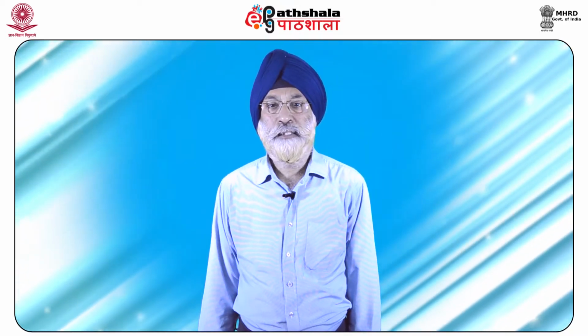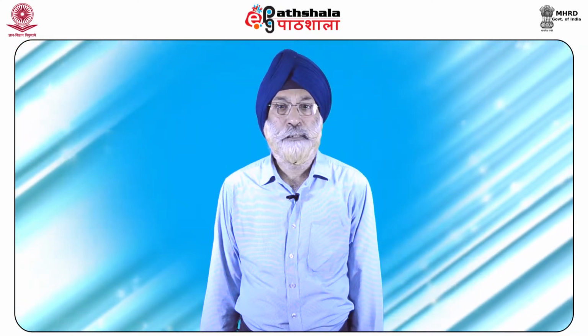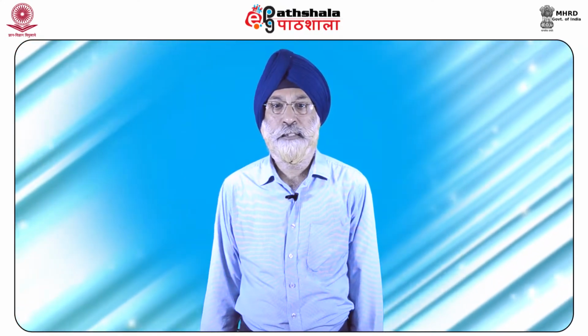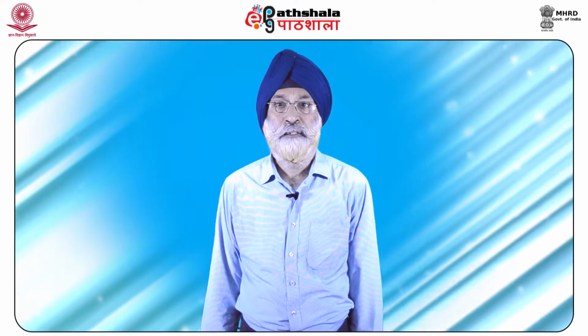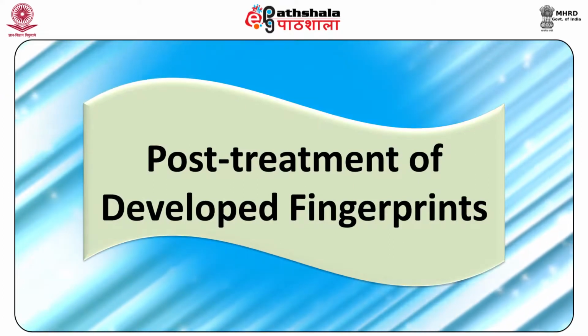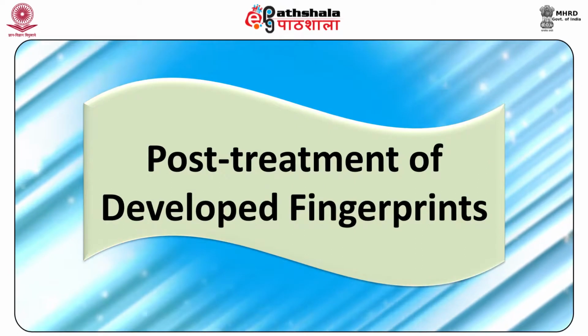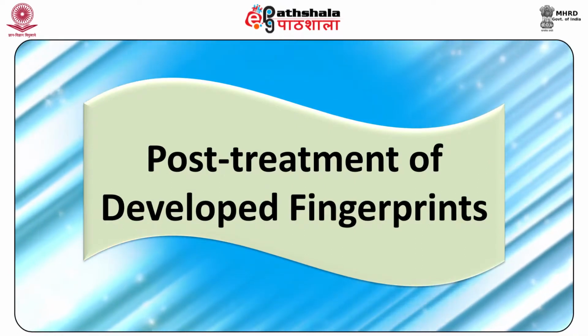To extend their lifetimes, it is recommended that ninhydrin developed fingerprints should be stored in a dark place at a low level of humidity. Next, we take up the post-treatment of fingerprints developed by ninhydrin.